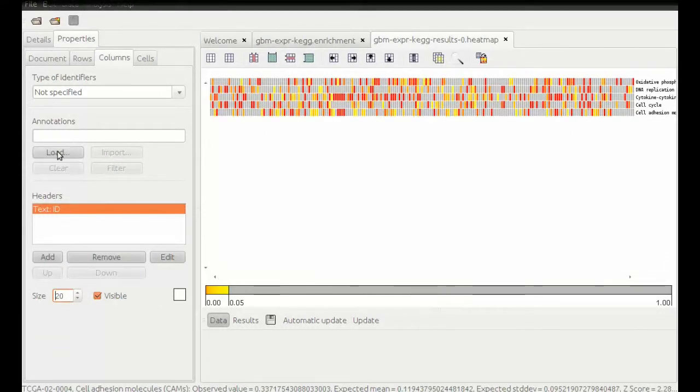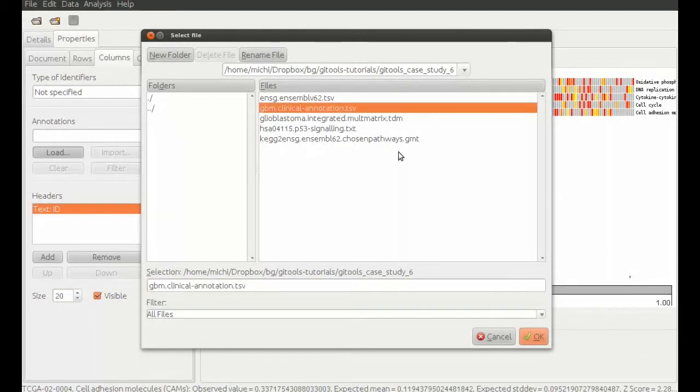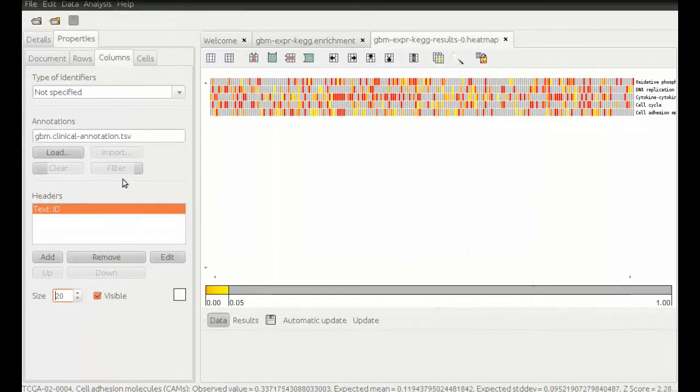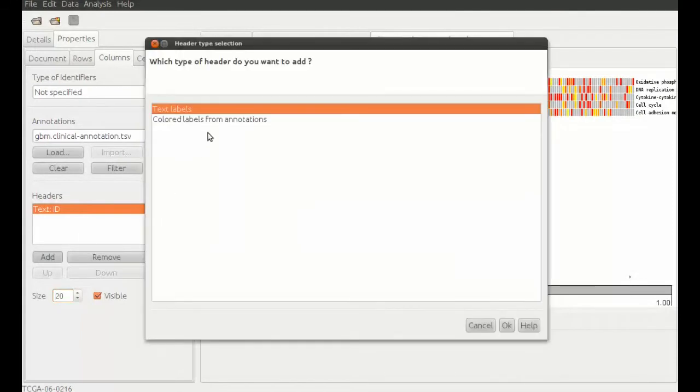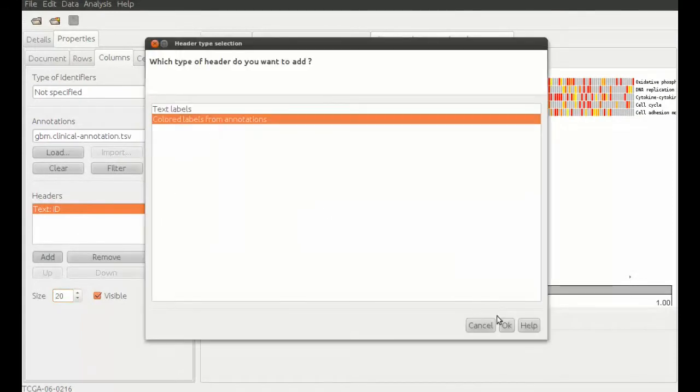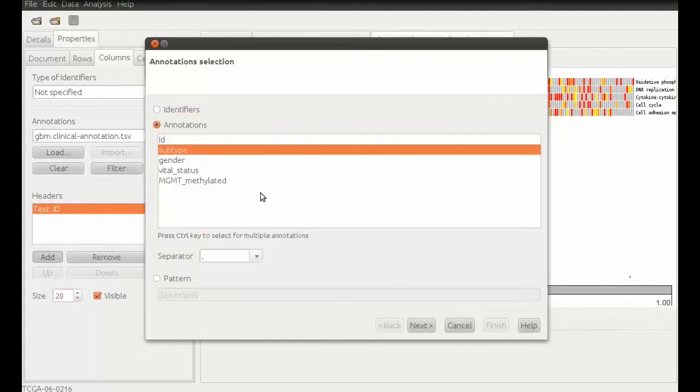To add more information, we load clinical annotations for our samples. Upon loading, we can add the information from that file to the matrix as headers. We choose to add glioblastoma subtypes as colored labels.